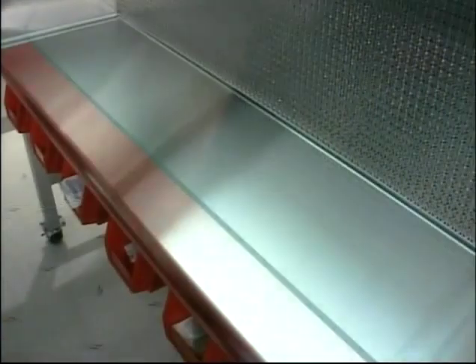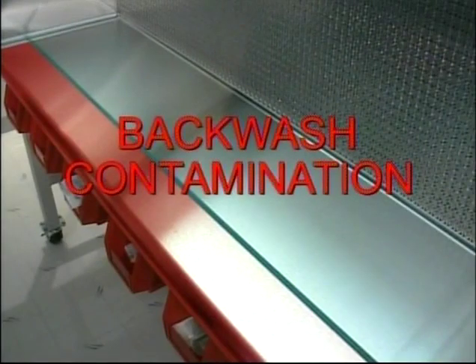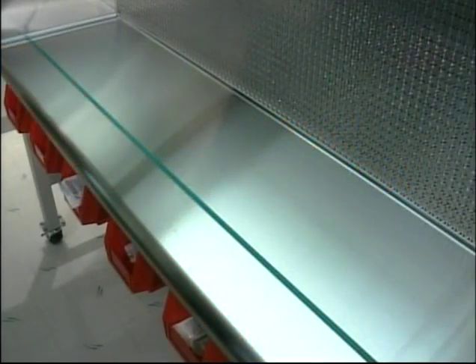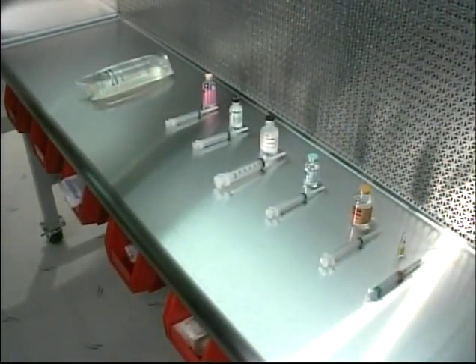It should always be assumed that air in the front 6 inches in from the open end of the LFCB is contaminated by backwash contamination. All items in operation should be located well behind an imaginary 6-inch line, with all objects sufficiently separated to assure good airflow around them.